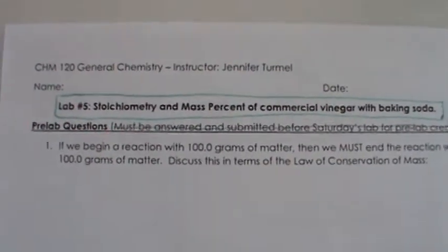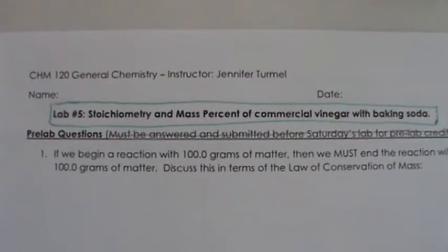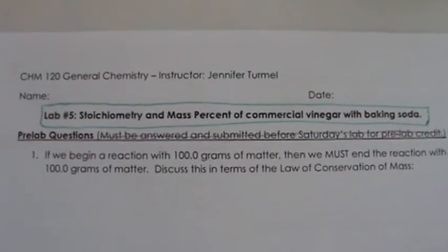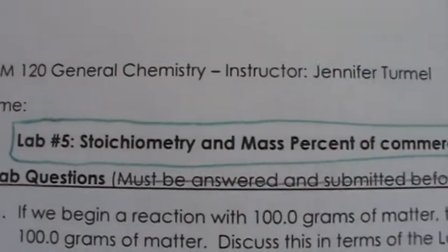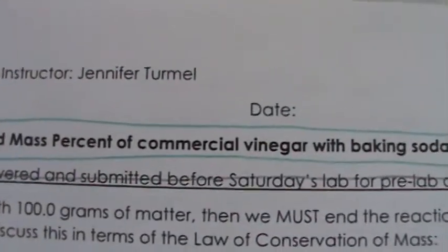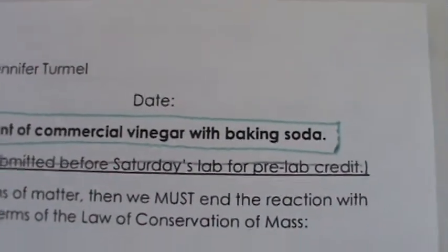Welcome back to our virtual labs, and this is for Chem 120 General Chemistry online labs. And today we'll be doing Lab 5, Stoichiometry and Mass Percent of Commercial Vinegar with Baking Soda.